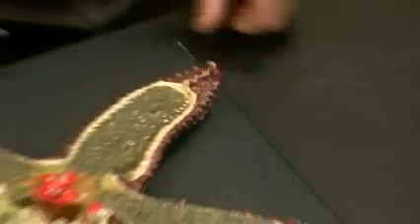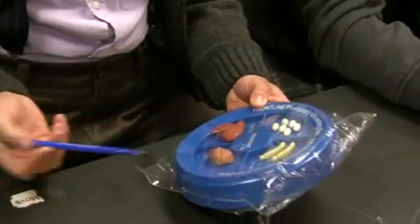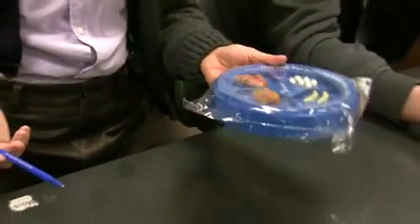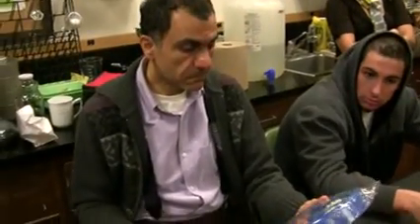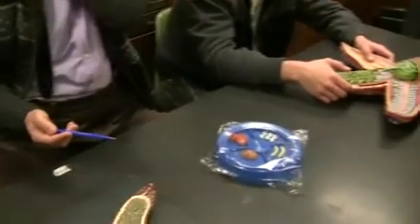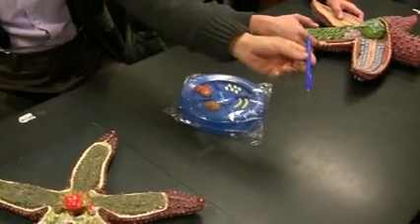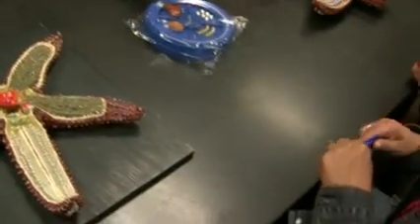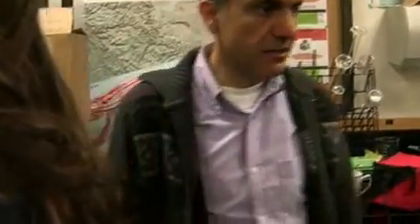Okay? Flea, life cycle of flea. I don't have the adult flea, just the eggs, larva, and pupa, and then it becomes a flea. I don't have much to say about this. You're going to be asked what kind of metamorphosis, so it'd be holometabolism, complete metamorphosis. I will ask you what order, what disease. What disease? Interesting. The dog heartworm? Not heartworm. The dog tapeworm. Dog tapeworm? That's it. Dog tapeworm, Dipylidium caninum.